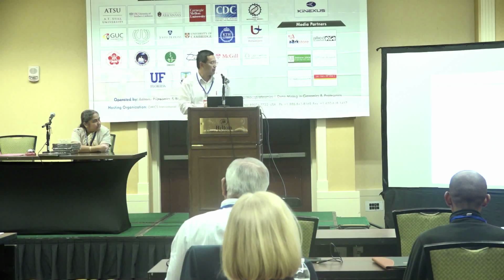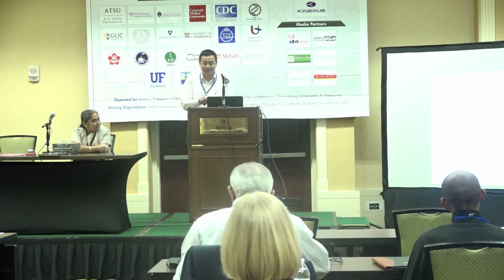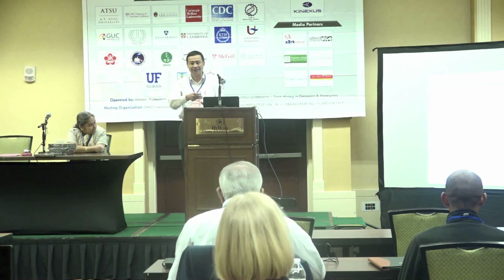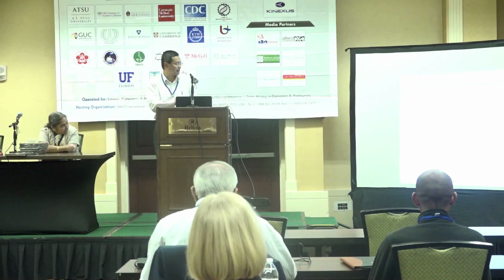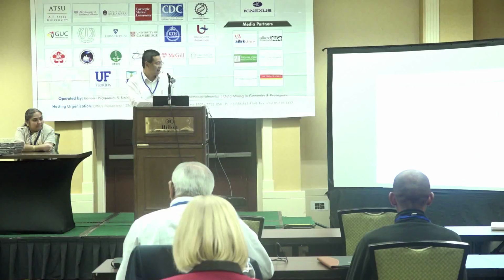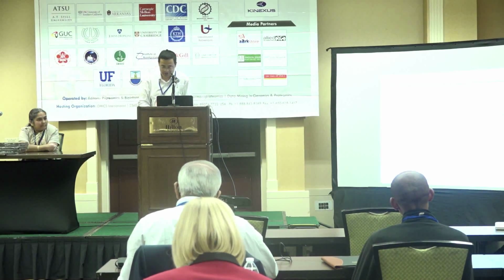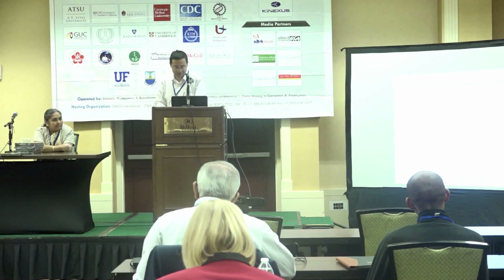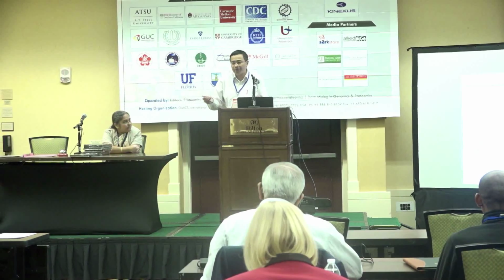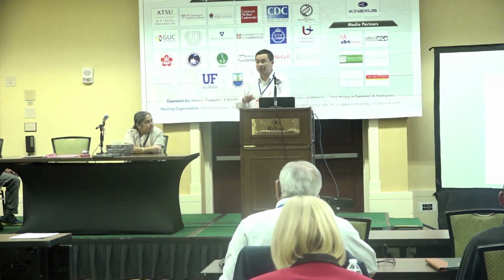So another way to measure activities is to look at the metabolites. A lot of enzymes will convert substrates into product. So if you can use metabolomics to measure the substrate and the product formation, you're doing activity-based proteomics. So essentially it's a combination of metabolomics and proteomics. These are really, really powerful because a lot of time protein changes may not correlate with activity, which is really important.